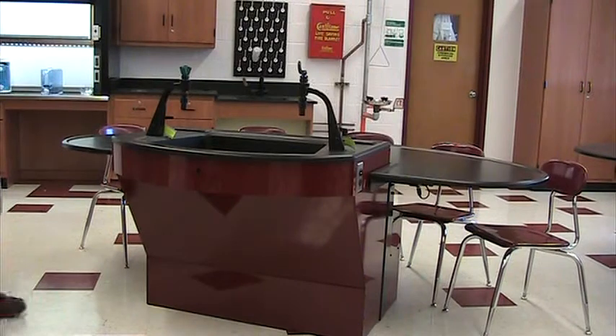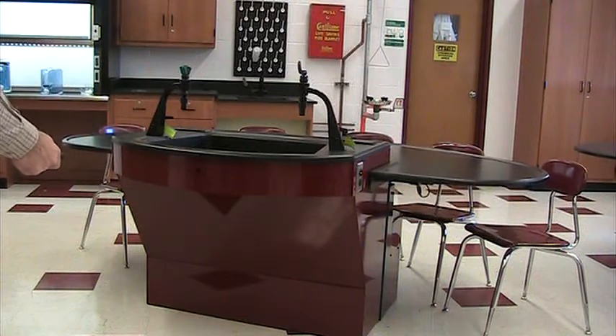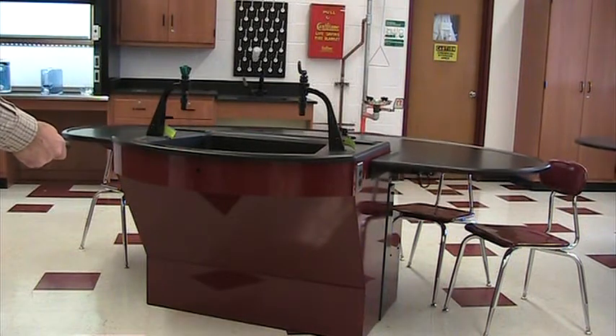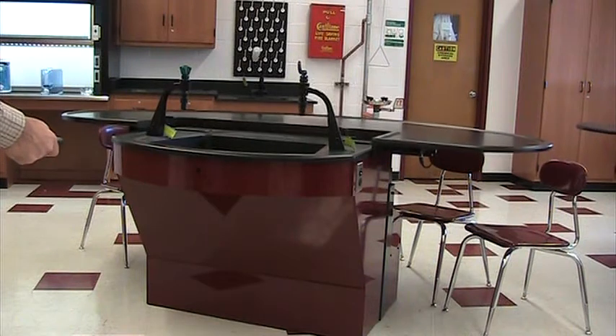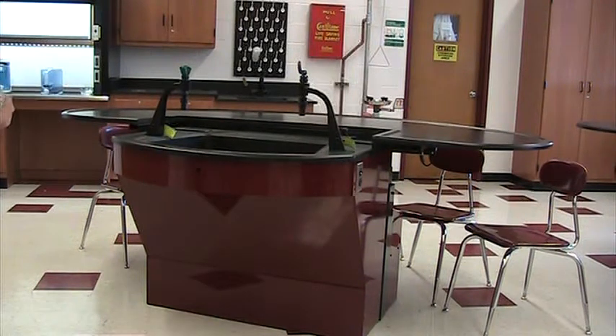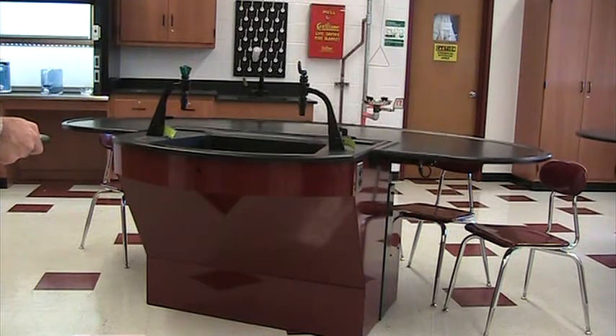The uniqueness of this unit is that by remote control of the teacher, the units will raise from a sit-down lecture position to a stand-up lab position — almost as fast as turning the channels.